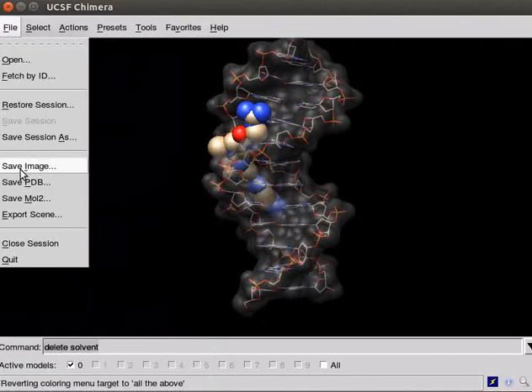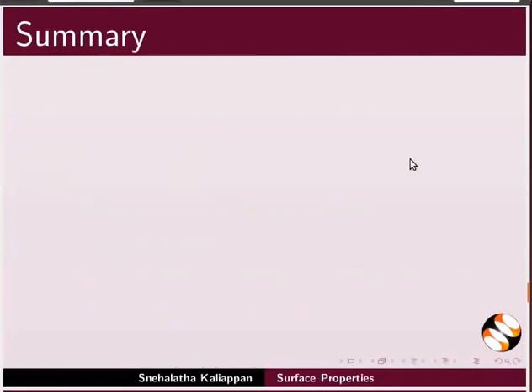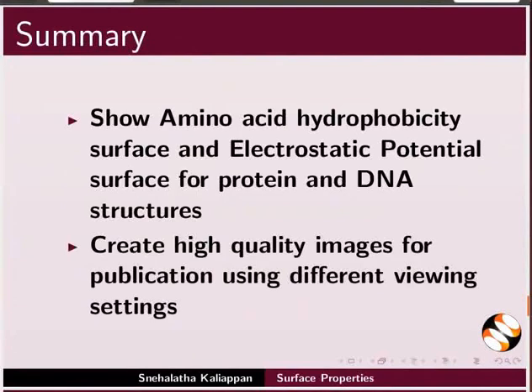Save Image using Save Image option from the File menu. Let's summarize. In this tutorial, we have learned to show amino acid hydrophobicity surface and electrostatic potential surface for protein and DNA structures. Create high quality images for publication using different viewing settings.